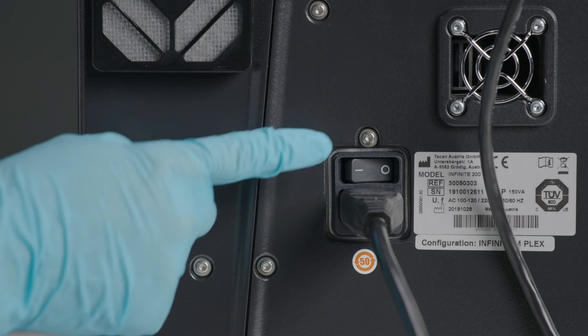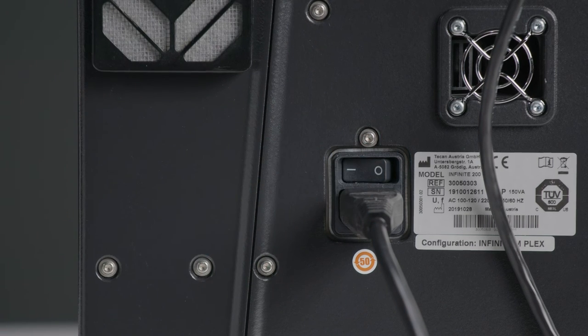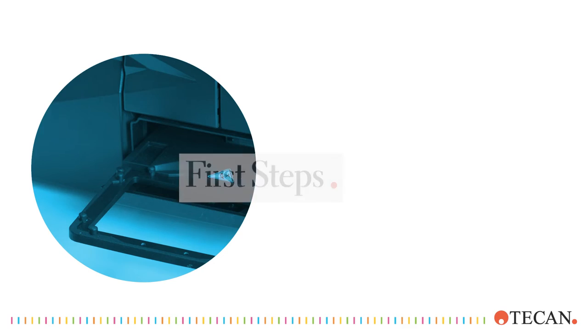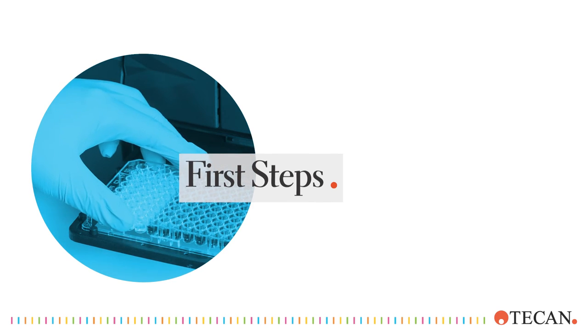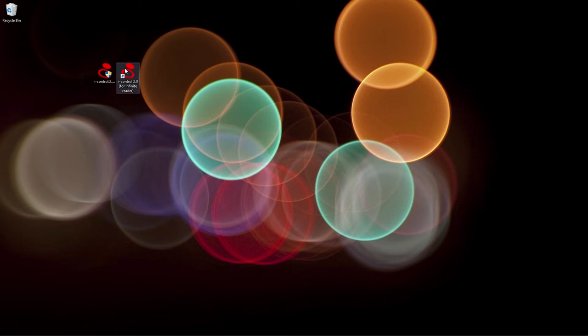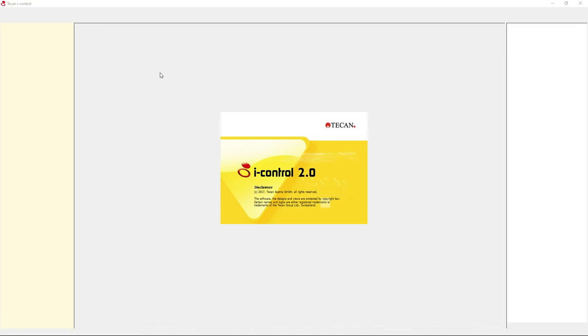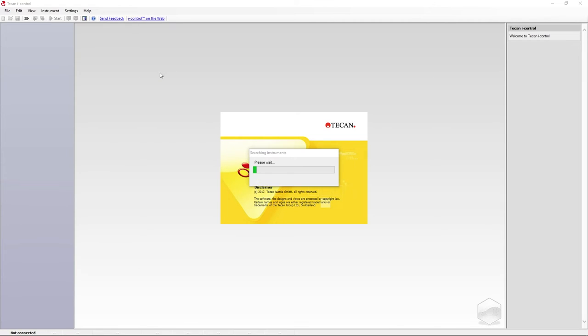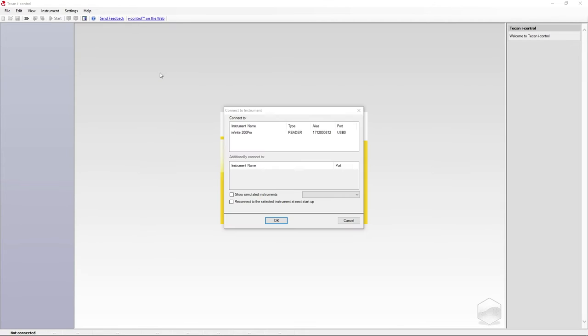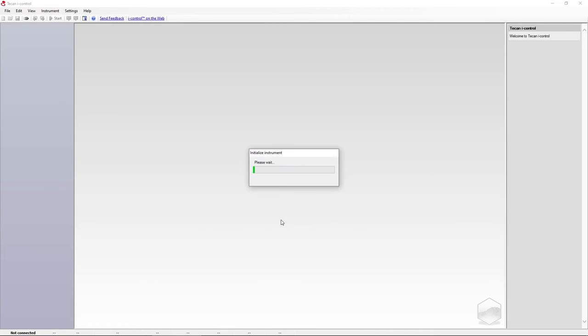Turn on your instrument with the power switch. Now we're going to demonstrate the first steps of a measurement. Open the iControl software and connect it to your device. Check this box to reconnect to the instrument at the next startup.